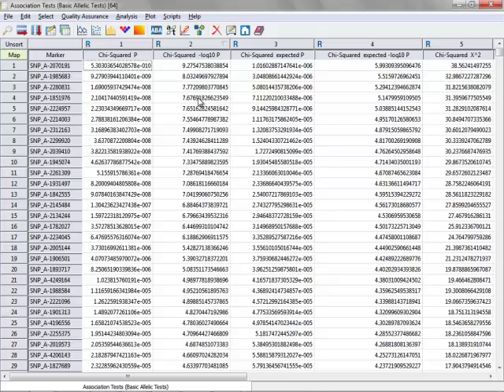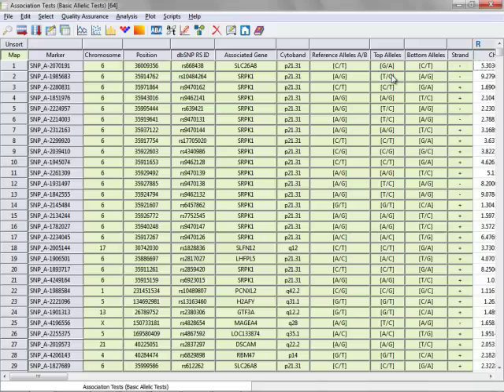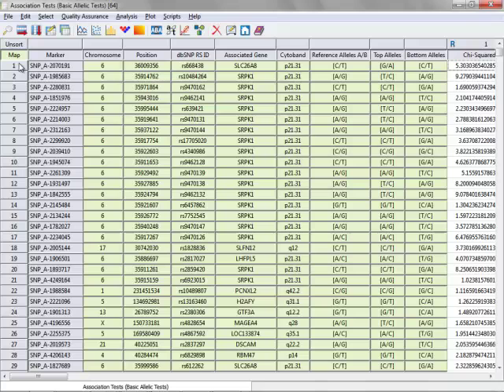This then sorts the spreadsheet by the most significant SNPs. If I click on this map button again, you can now see that the marker map information here is shown on the left as opposed to the top. I'm going to go ahead and hide some of those map fields so we can see the association test results better. Right-clicking and unchecking those boxes again.